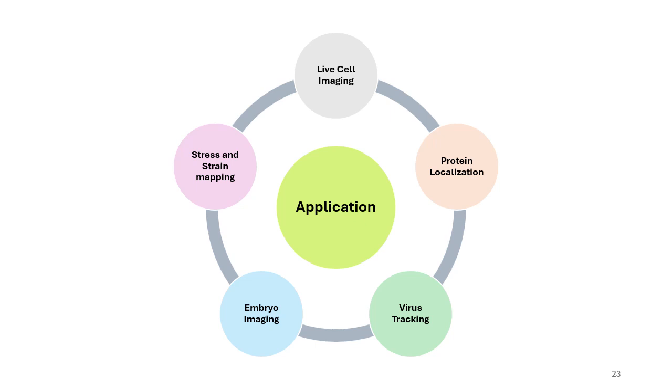So fluorescence microscopy is an efficient tool for visualization of biological molecules and to understand the material's properties at molecular levels. Here I have mentioned some of the applications of fluorescence microscopy. With the advancement of this technique with time, researchers from various fields are also interested to use this technique more frequently, as it is capable of providing insight into molecular interactions.